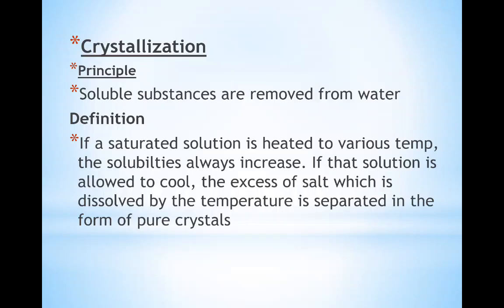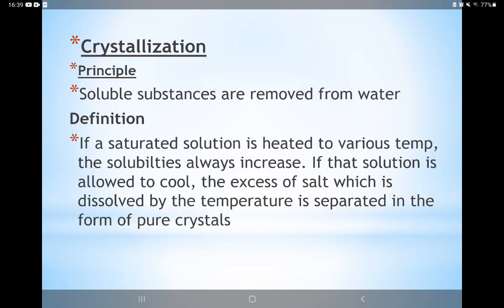Now, crystallization. The principle of crystallization is that soluble substances are removed from water. The definition is: if a saturated solution is heated to various temperatures, the solubility is always increased. If that solution is allowed to cool, the excess of salt, which was dissolved by the temperature, is separated in the form of crystals.